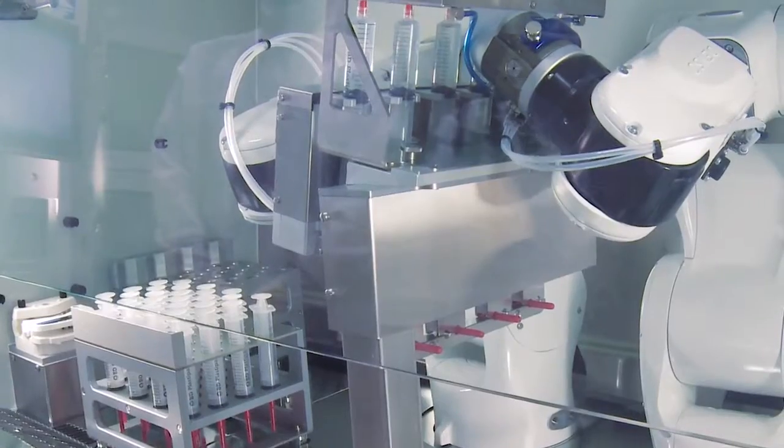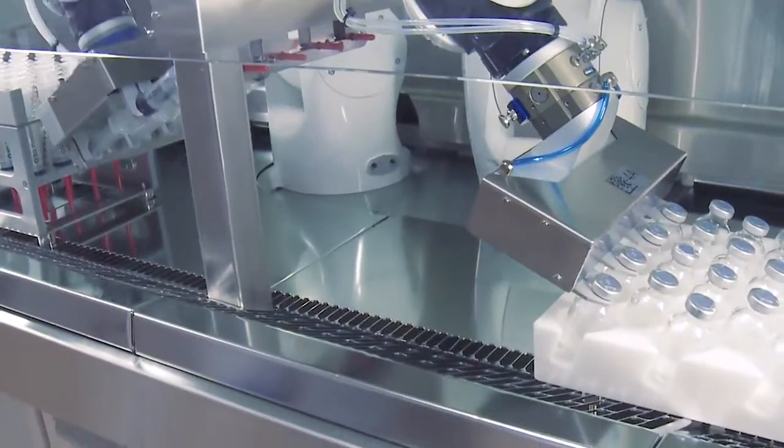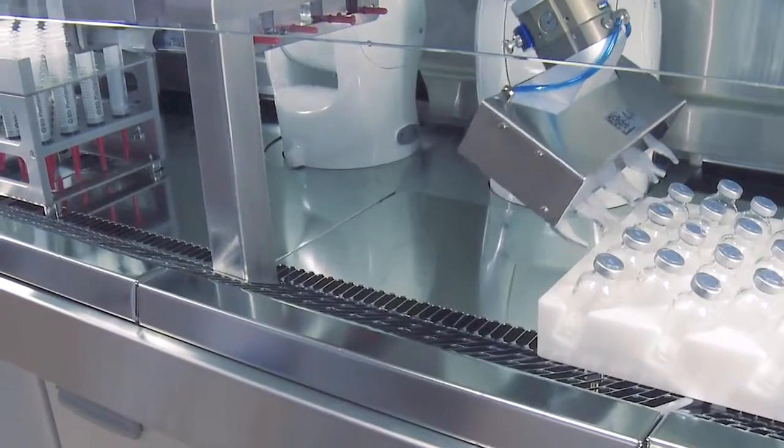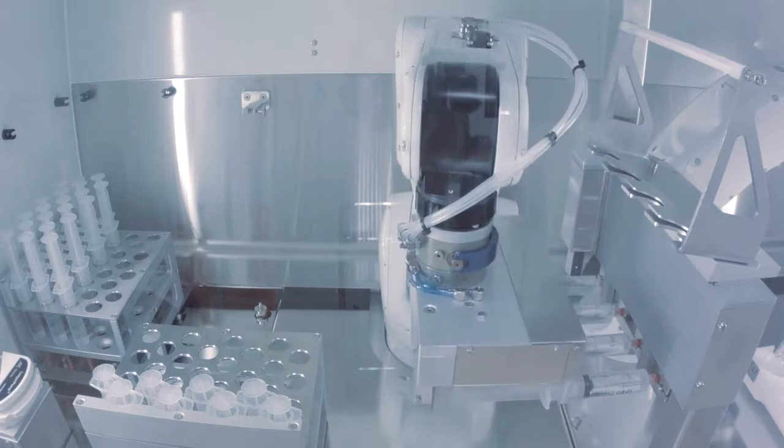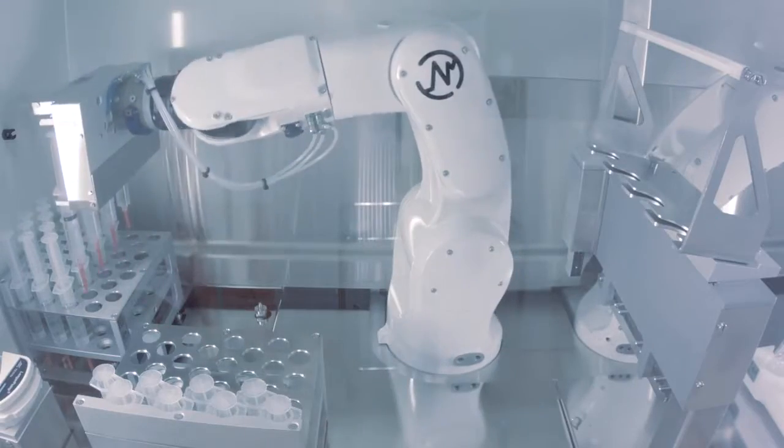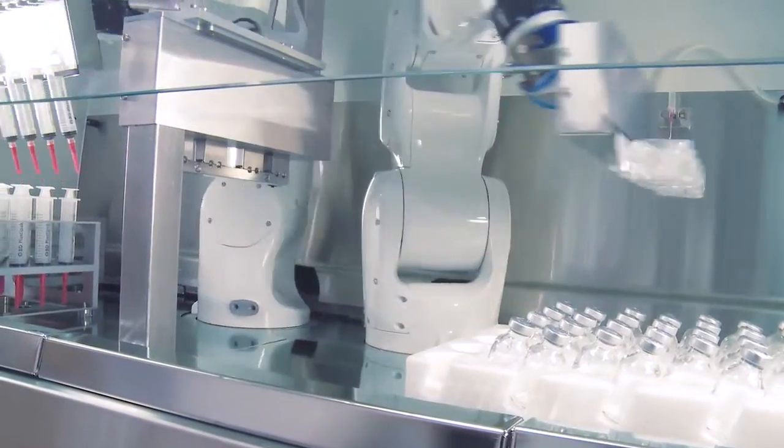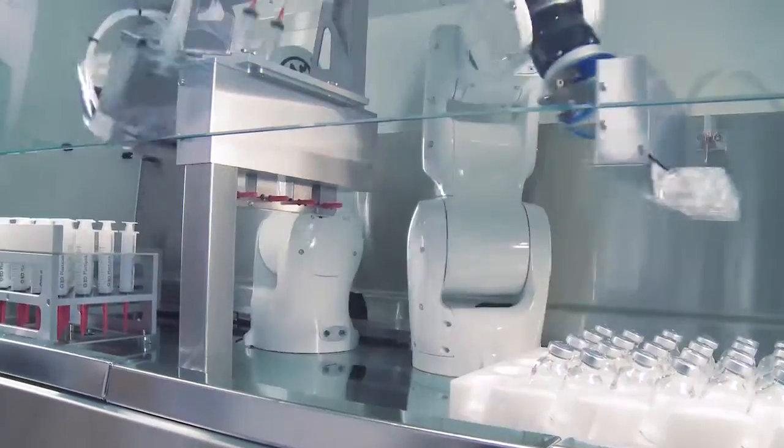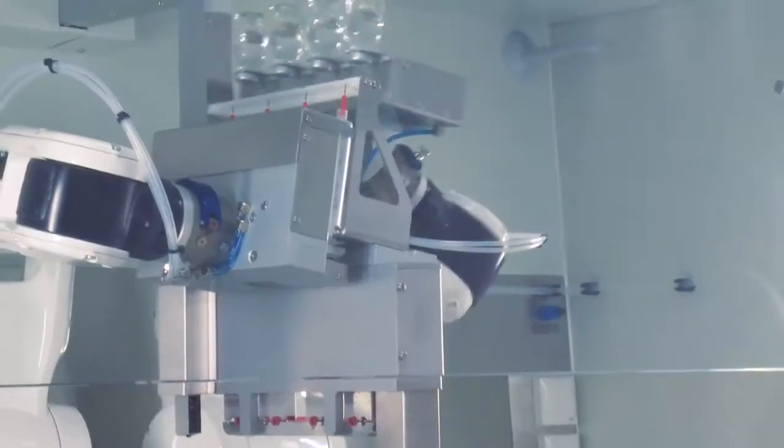The dose vials are returned to their original places on the tray. The syringes are placed back in the syringe rack. The robots repeat the same steps for each dose vial and syringe set in the program.